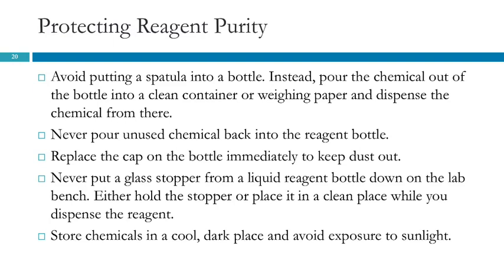Never put a glass stopper from a liquid reagent bottle down on the lab bench. I think we've all done that. Right? You should either hold it or place it in a clean place while you dispense the reagent. So the larger glass stoppers have like a flat, almost coin shape to them, a tab. And you can stick those between two of your fingers and still have the use of your hand. And so you can hold that stopper and deal with your reagent, and then you can stick the stopper back in the flask. And that's the proper thing to do.